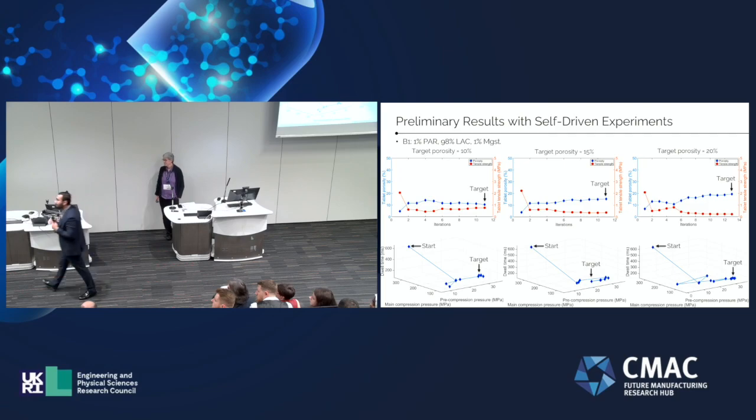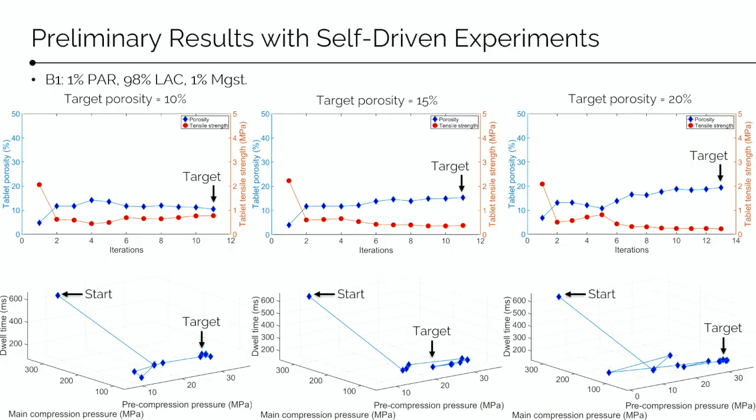So I'm going to bring this back to the NIR blend or the calibrations. Your calibration is, I assume, tested on a blend and it works, but if you make any changes to the blend, do you need to do anything with the calibration?